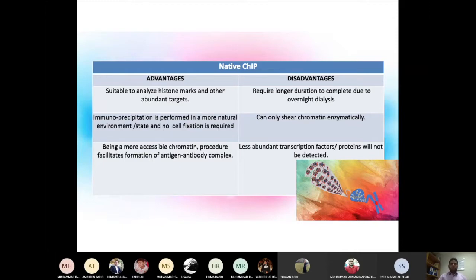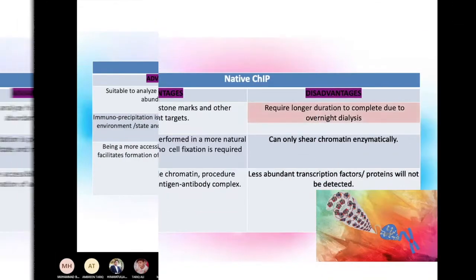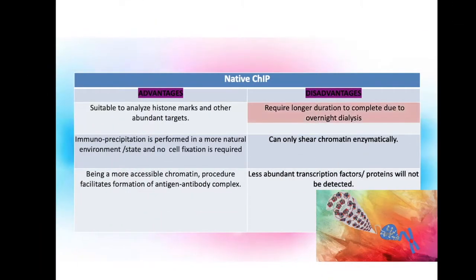Secondly, being a more accessible chromatin procedure, it facilitates formation of the antigen-antibody complex because of their natural affinity. However, this process requires a long duration to perform. Because it's a natural environment and complex formation takes longer, you may have to leave it overnight.